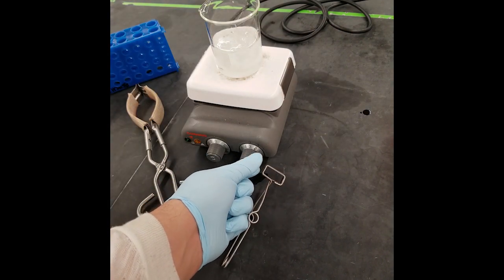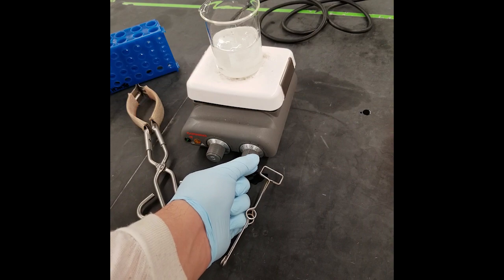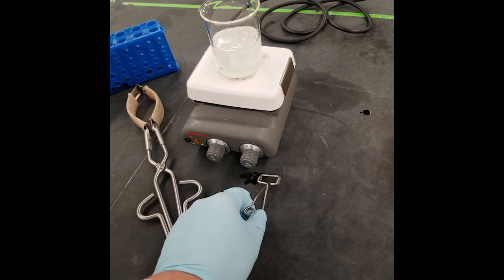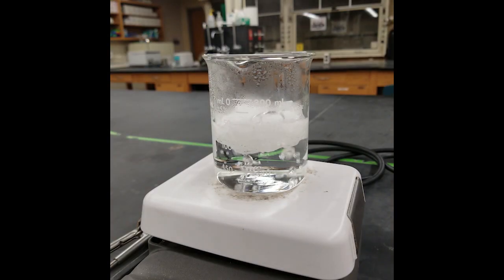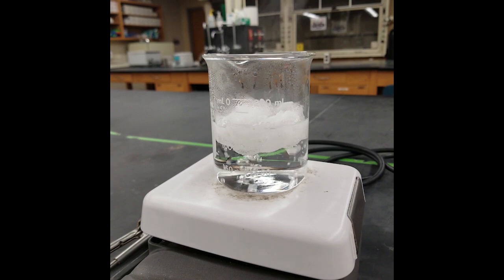This setting will vary depending on the make and model of your hot plate, but essentially you want a very soft boil within 15 to 20 minutes. Seeing your water boil is a visual indicator that the temperature is at least 100 degrees Celsius, but your teaching fellows also have thermometers to verify the temperature of your water.